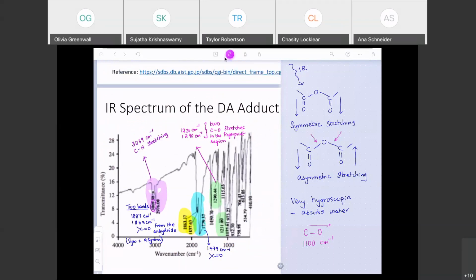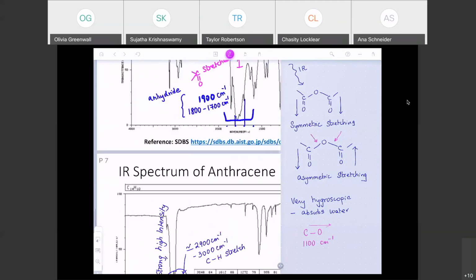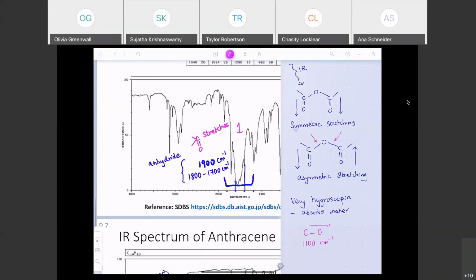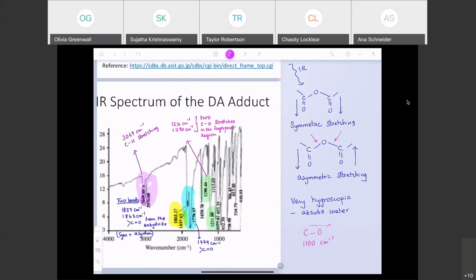I'm going to just pause here for a minute, and then I want to jump into the lab flow and show you what you do there. So you've got three spectra, okay? You can get a blank spectrum and write this nicely if you want. And then you're asked to upload some things, and I'll show you that as well.